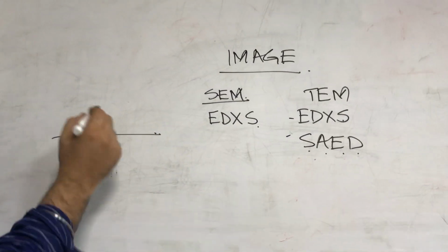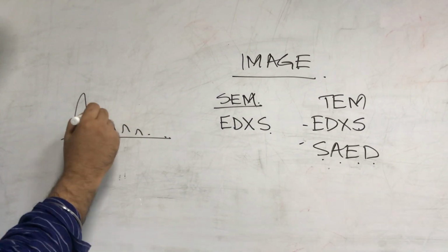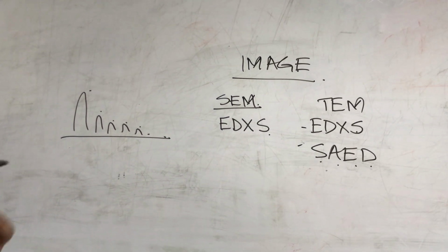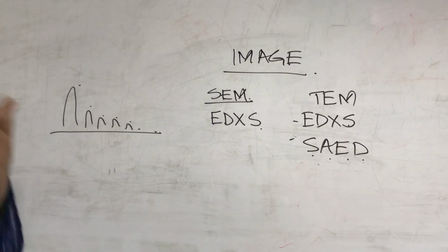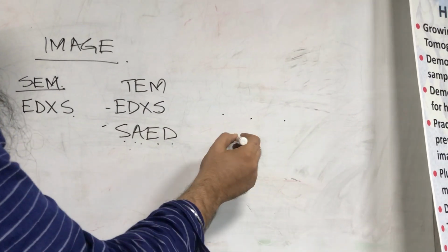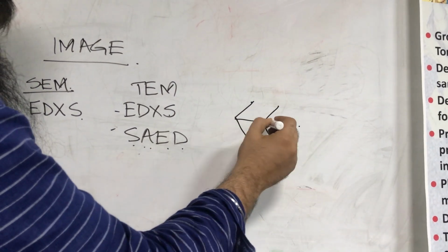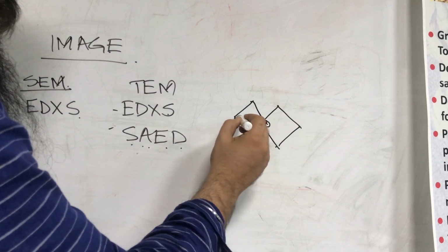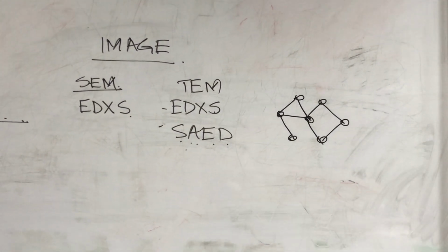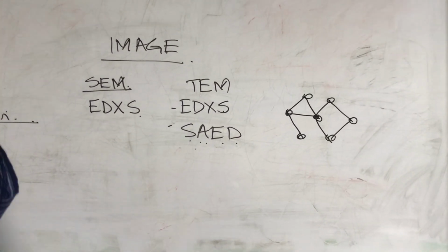The EDX, we will take a small part of the sample and we will get results as peaks. So we will be able to understand what are the elements that are present in a particular material or the particular compound or the particular sample that we are seeing. What happens in this is that the interatomic structure, the lattice, how it is arranged, can be seen. This can be compared against a standard and we can very conclusively see what is the composition of the material.